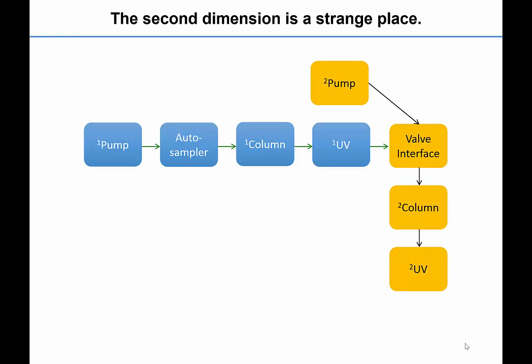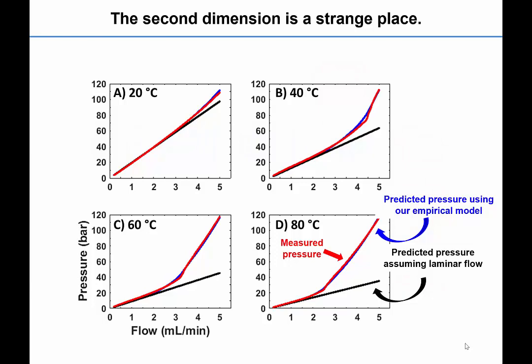Recently, we have discovered that turbulent flow can develop in the second dimension of the instrument, which can lead to much higher than expected operating pressures. This slide shows that pressures predicted for second dimension using conventional models do not accurately describe what we see in experiments.